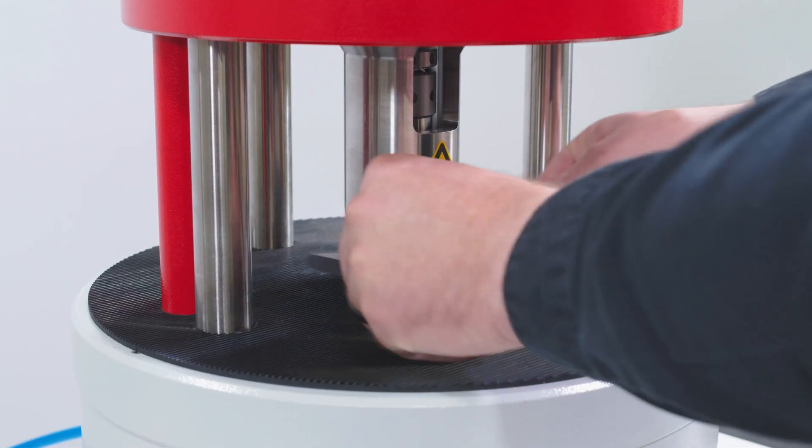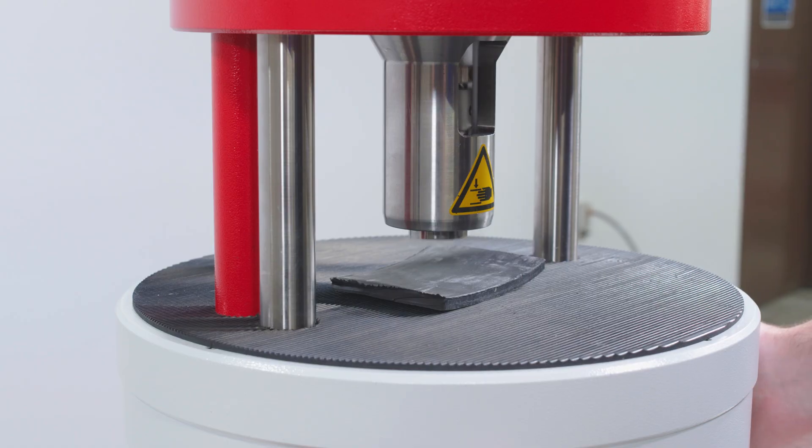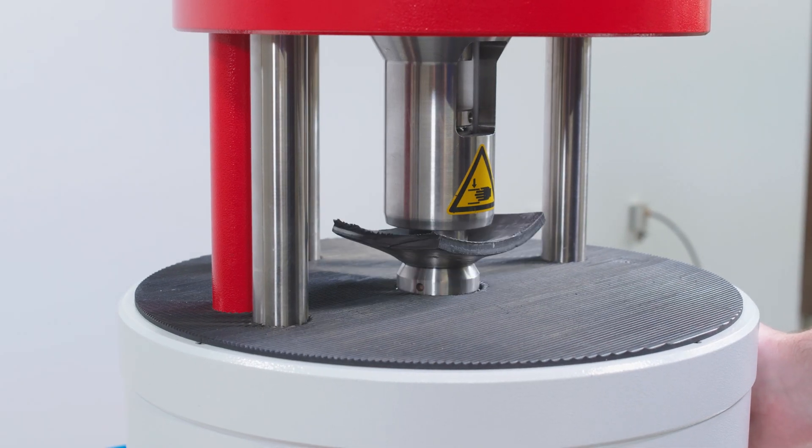The RVS is designed to be fast, safe and easy to use. To cut a sample, simply place the material onto the cutting area, then press and hold both buttons on the side of the machine for the duration of the cutting sequence.